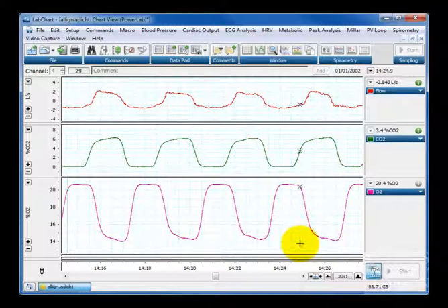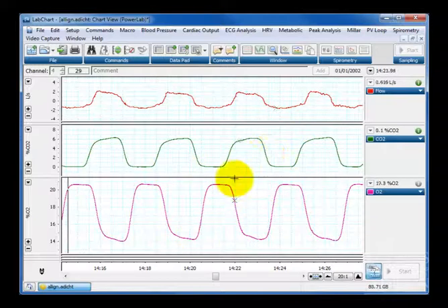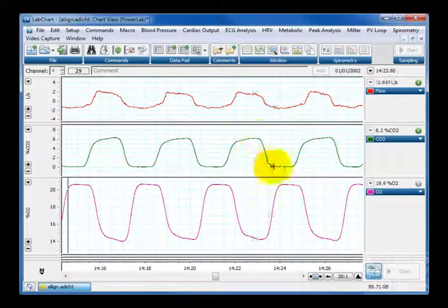So on the screen here we have a quick example of this. We have a flow reading at the top taken from the spirometry module as part of a PowerLab setup. Underneath here we have two channels from a Servomex, the CO2 reading in green and in pink we have the O2 reading.